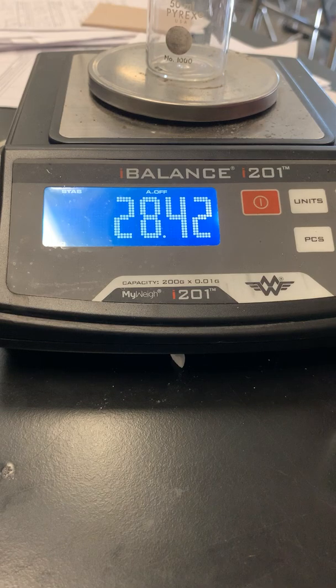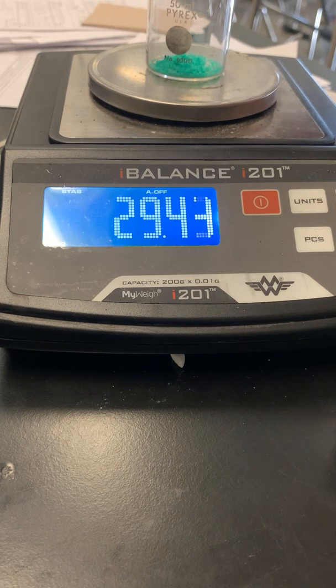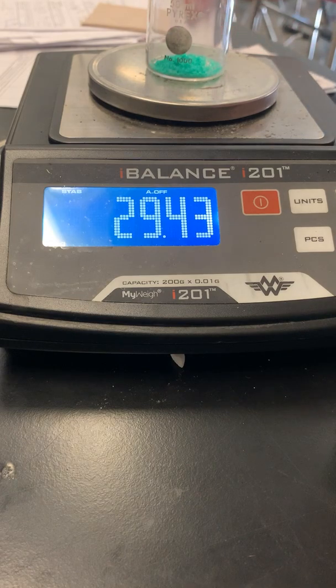I need to check the video. 29.1. I got to get a little bit more in there. 29.4. Remember, we started at 28.4. And so, I messed this up again.